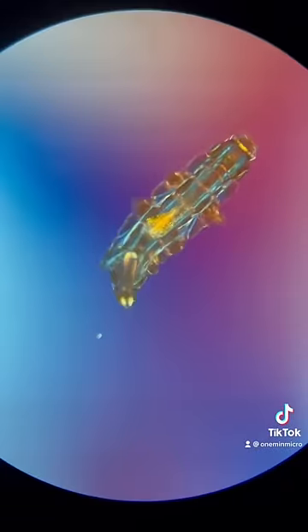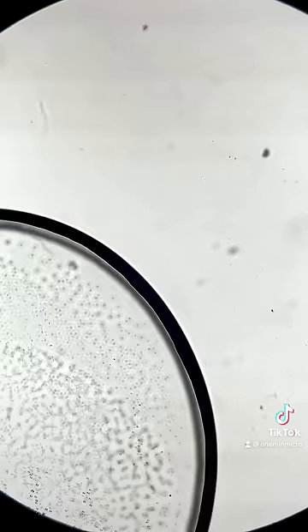Check this out. There's a water bear. Okay, I'm just joking with you — there was no water bear in this bottle of water.